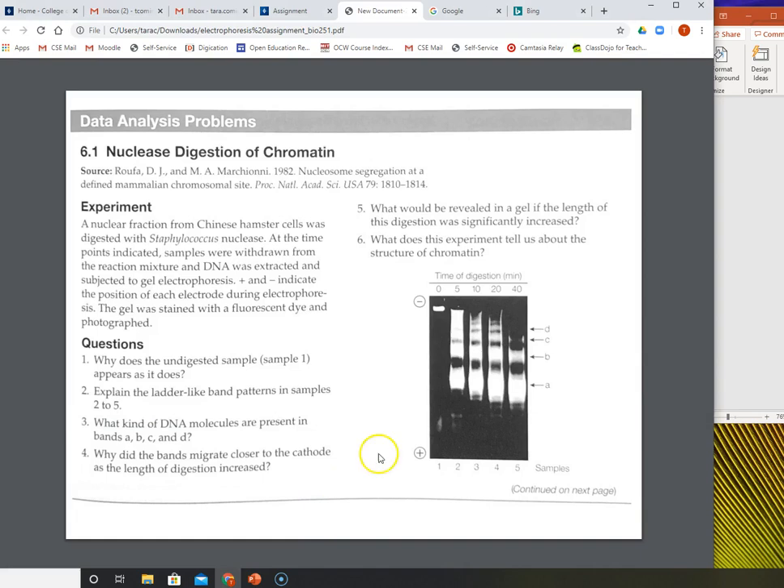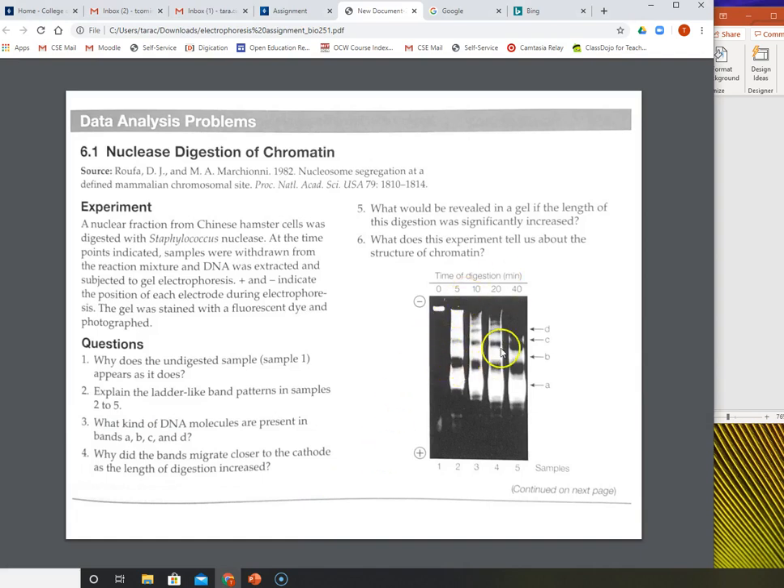It's necessary to understand where the nuclease is cutting. The nuclease is cutting at the linker DNA. If it cuts every single one of these, all you would have is a 200 base pair band. Now going back to the assignment — this gel is a little messier, and this is kind of reality. Usually when you run a gel it might look something like this. Where you see brightness is DNA. Question one says: why does the undigested sample, sample one, appear as it does? The only place where there is DNA is up here, basically in the well.